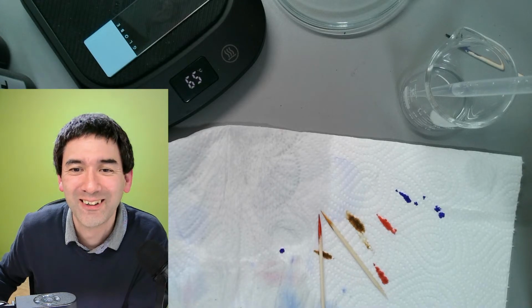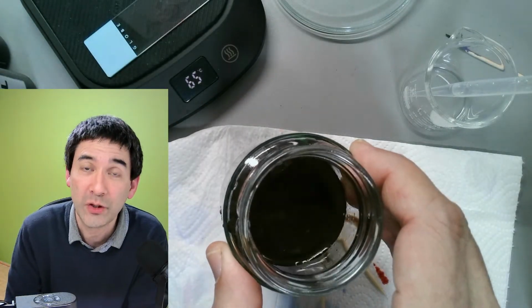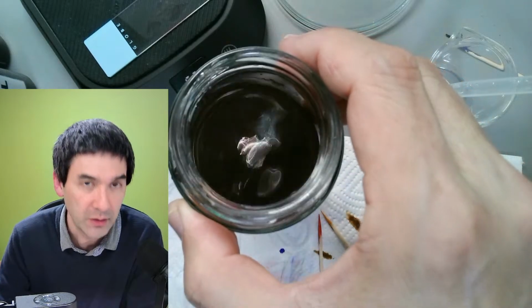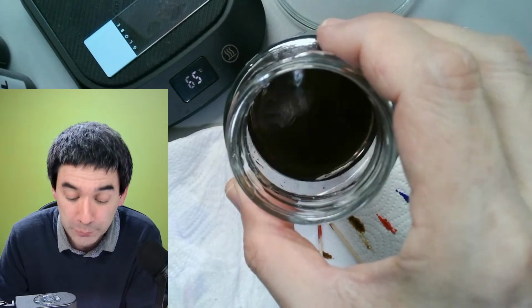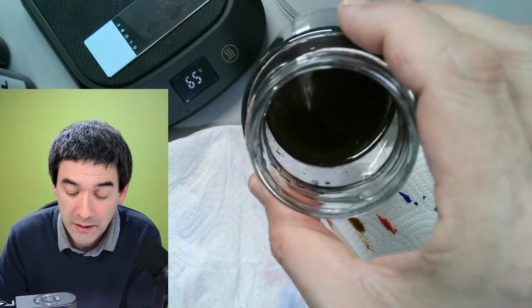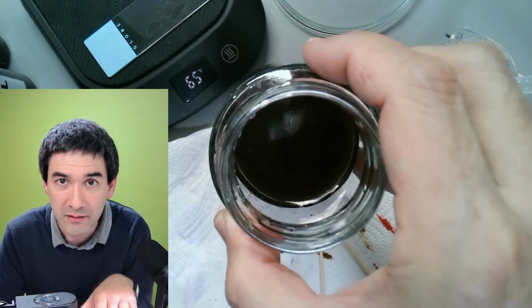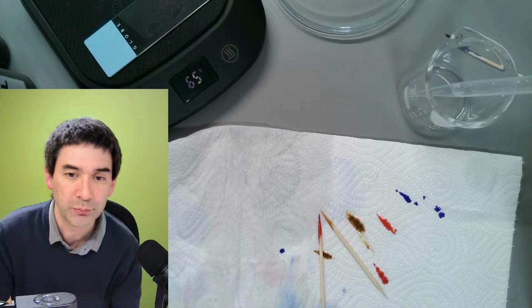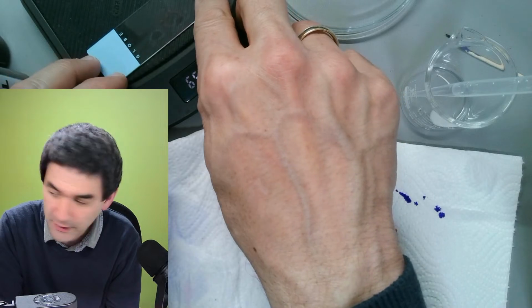So, how do you dispose of the waste fluid? This one over here, I basically do the following. I just dilute it with water and pour it down the drain. Not a problem. These stains are not toxic or anything, especially not at these concentrations. The alcohol is not a problem. The iodine is not a problem. However, I always dilute it first, otherwise it's going to stain the washing basin, and then you won't get it out. But these stains are actually not a problem. Okay, I just see that it's slowly starting to completely dry up now again.